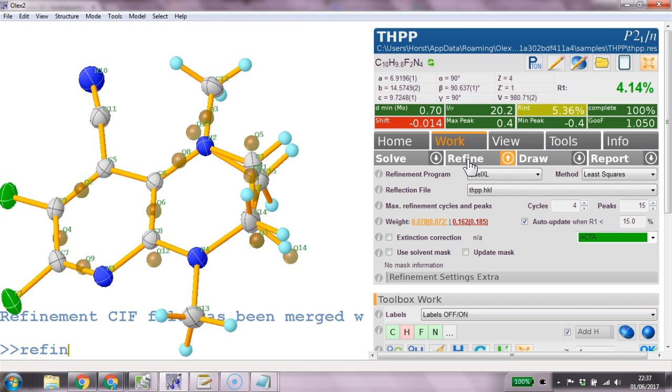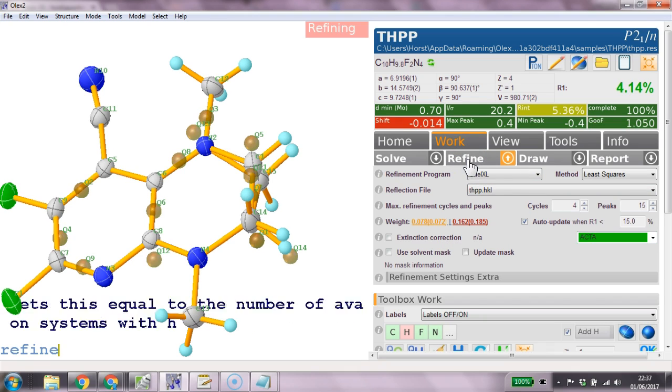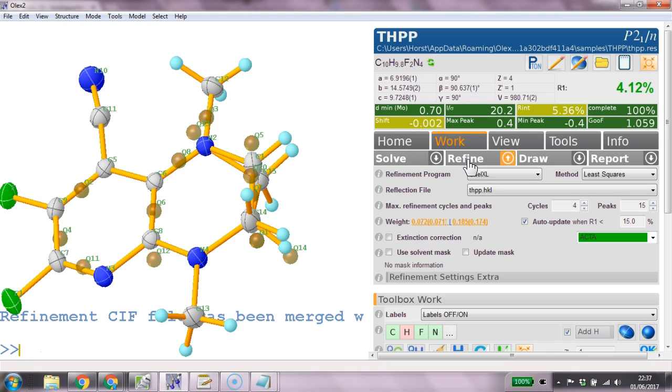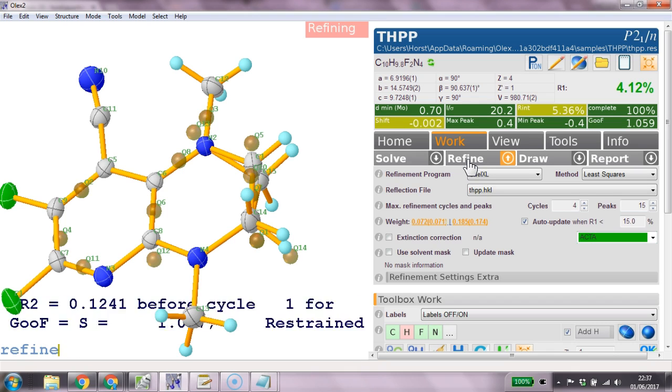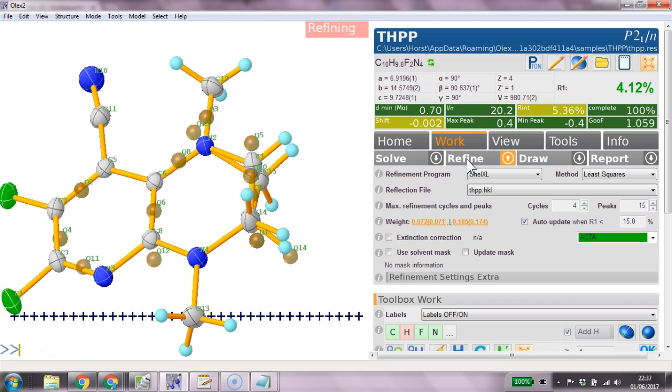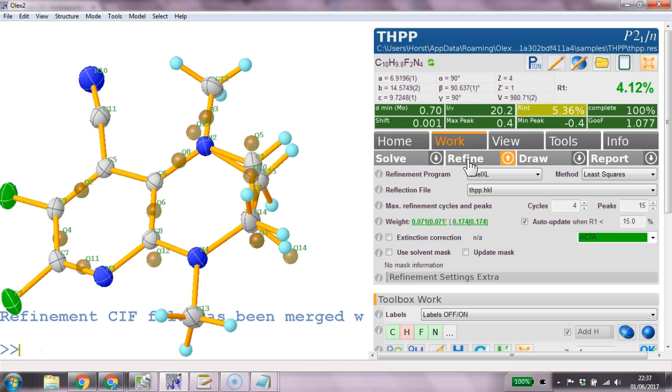Another refine. And then we should be done. Last one. And thank you for using OLEX2.